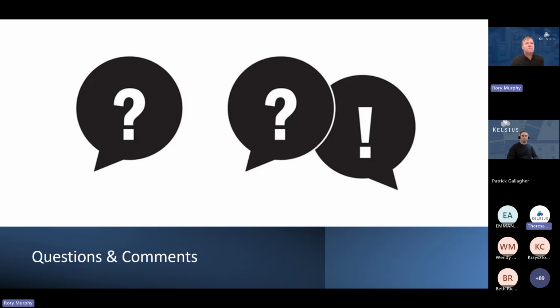Okay, I have another question. I don't know if it's something we can answer. It's regarding a service for a -80 freezer. This is from Alison. Hi, is the temperature mapping carried out as part of standard service on a -80 freezer? They currently have a yearly service.